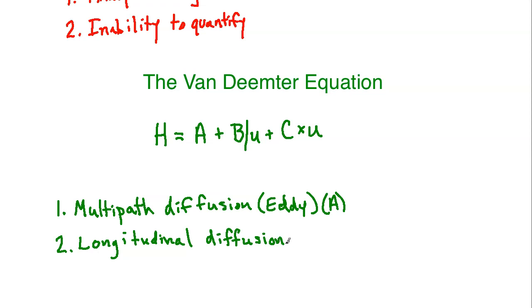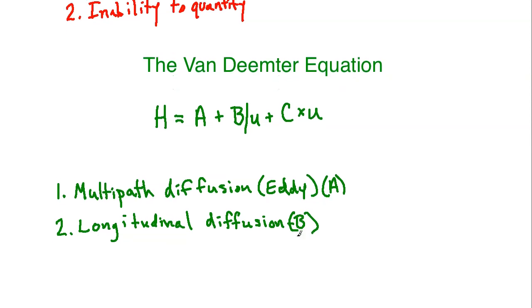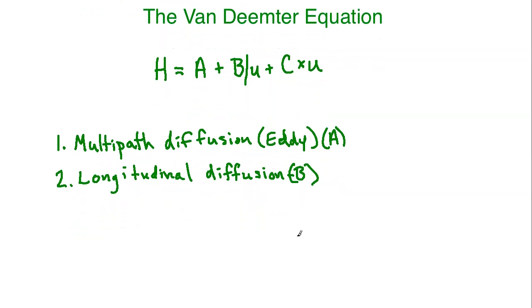This is a process that is going to occur throughout nature. Okay, so when you have something that is in a high concentration in one area, the tendency is for it to spread out to areas of lower concentration. That is longitudinal diffusion. And so that's the second factor. And then factor number 3 is going to be what we would refer to as mass transfer.